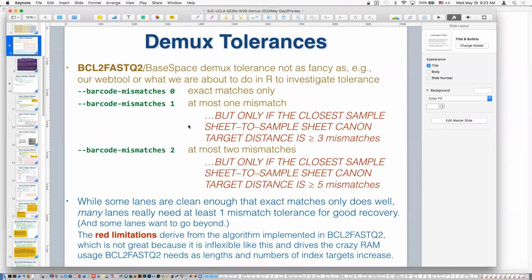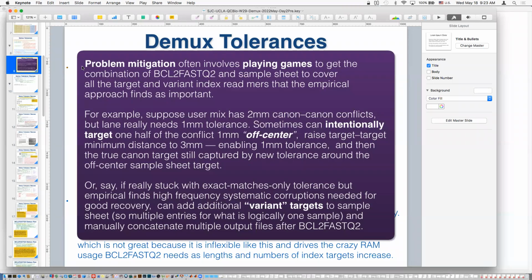So we had that sample yesterday that was basically 20 million recovery with 1 mismatch, but only 16 million recovery with 0 mismatch, because there's a 1 mismatch variant that's like 4 million. A single 1 mismatch variant is like 4 million. That was the situation yesterday with number 19. And so you get situations like that.